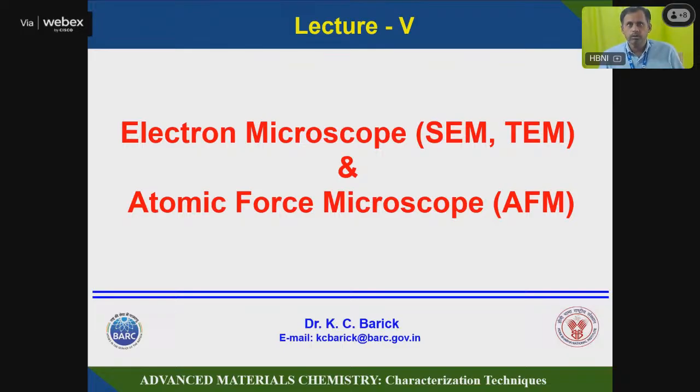Good afternoon. So today we will discuss mainly electron microscopes and atomic force microscopes. So far we have discussed different X-ray based techniques like diffraction and scattering techniques, and neutron diffraction as well, X-ray diffraction and small angle neutron and X-ray scatterings. So today we will discuss the electron microscope and the atomic force microscope.